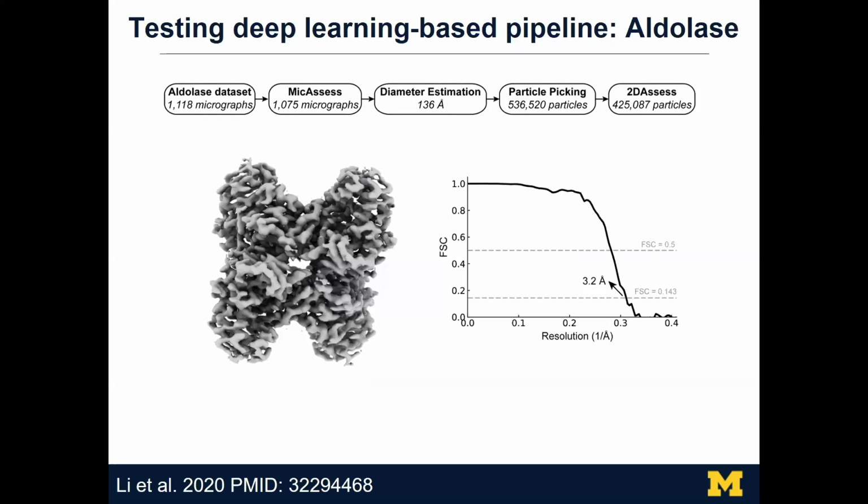I want to emphasize here that in all these 3 benchmarks, we did not try any post-processing. We basically don't try very hard for a better resolution. There's no CTF refinement, no particle polishing, etc. In all 3 benchmarks, we just put the micrographs into the pipeline, and it works sort of like a black box. We collect whatever is output by the pipeline and go straight into 3D.